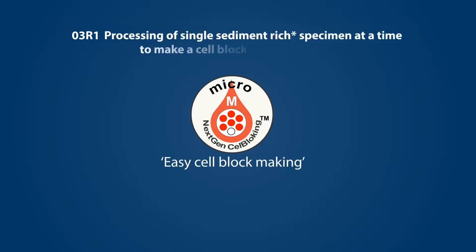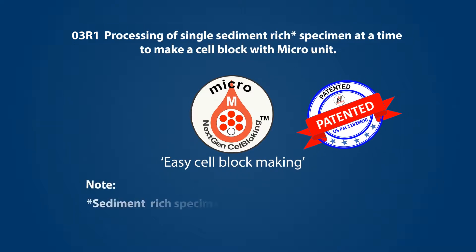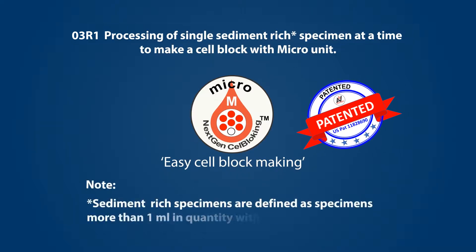Processing of a single sediment-rich specimen at a time to make a cell block with the micro unit. Note: sediment-rich specimens are defined as specimens more than 1 ml in quantity with more than 50% tissue crit.